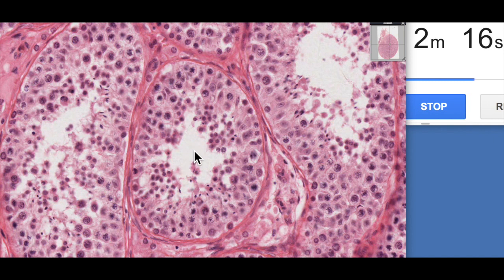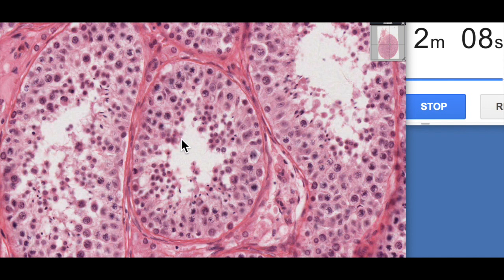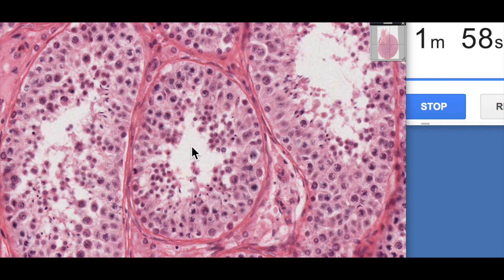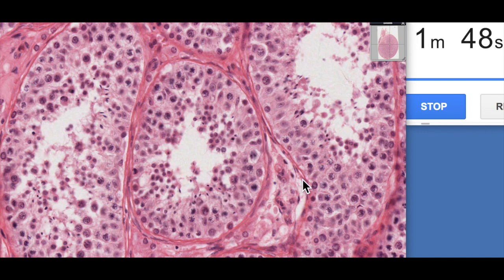When sperm are first produced, they're actually immotile — they can't swim on their own. They're moved along within testicular fluid produced by the nurse cells or Sertoli cells, and then contracted and forced through the seminiferous tubules. We've got lots of different cell types here with many nuclei, making it look like very busy tissue and interpretation can be a little tricky.